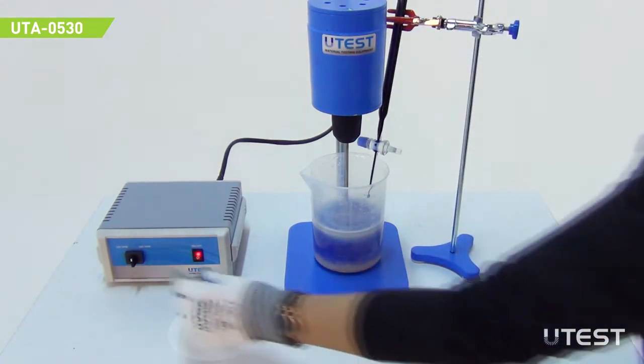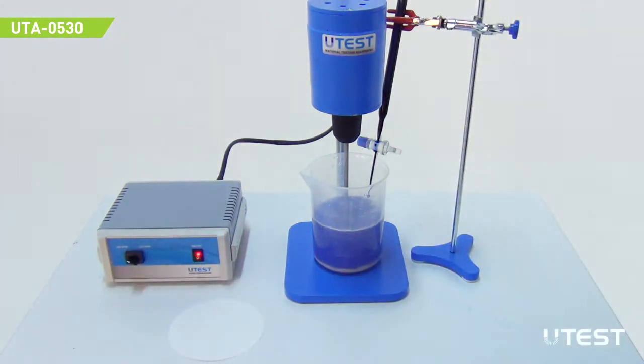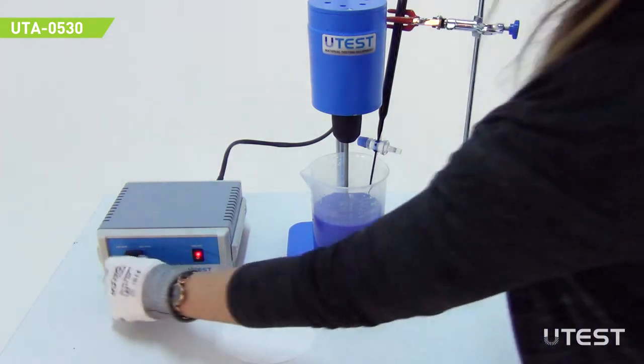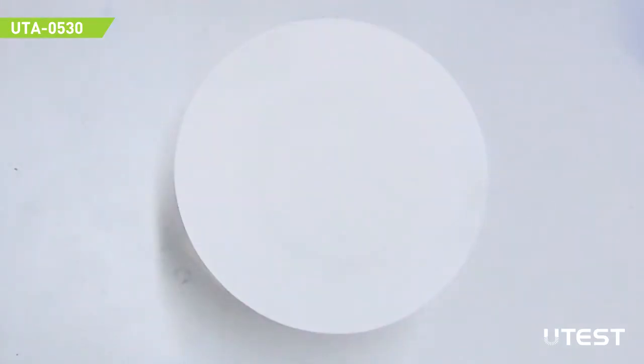Set the mixer to 400 rpm and the rest of the experiment will be conducted with this speed. After 1 minute of mixing, take 1 drop of solution by using the glass rod on a filter paper.